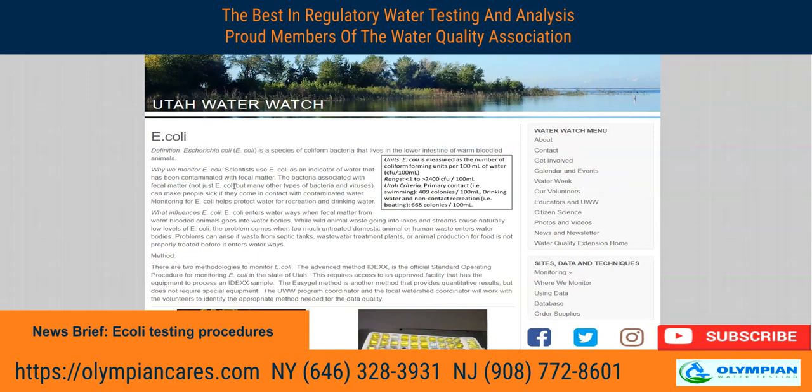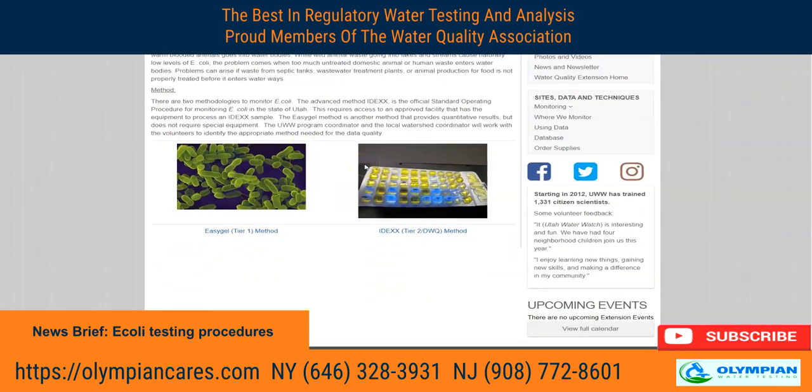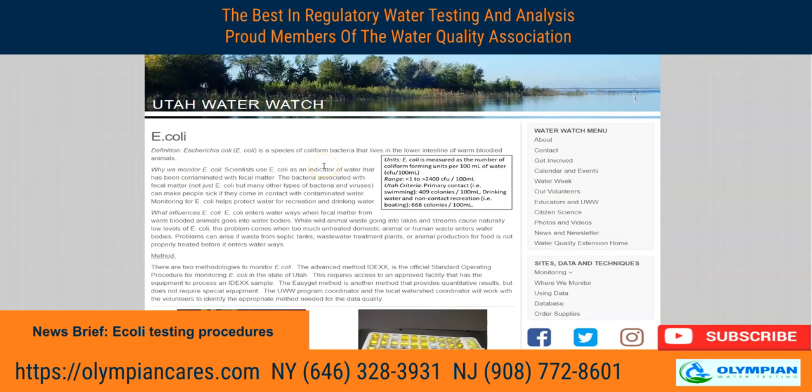Now, keep in mind with fecal matter and other waste byproducts, there still can be a lot of microorganisms going into the water. Not only E. coli, but other problems. So how do you know if they're there without performing these tests? Well, you can do the EasyGel or IDEXX method, but sometimes it's easier just to get a sample of water and then get it to a laboratory to get some professional testing to see if there's any microorganisms or E. coli in your water.